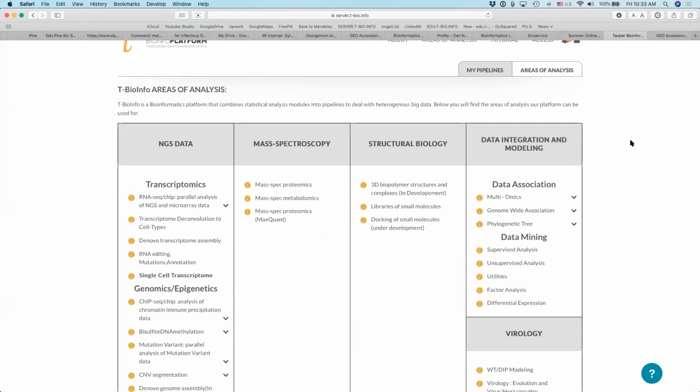Okay, so briefly let me explain. Okay, let's see. Compare the expression between the days, level of expression by heat map. Okay, good idea. So for example, if we want to do a comparison, that could be a differential gene expression pipeline. If we want to create a heat map, that's just visualizing those genes.